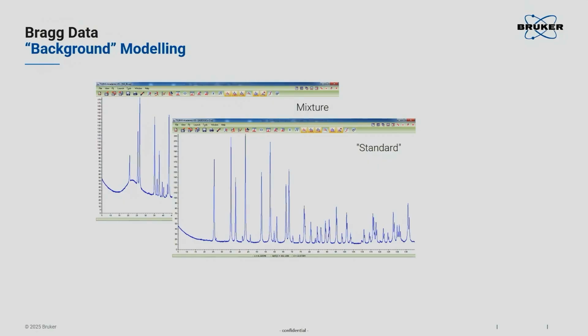Try different things without sample holder, and make sure that the data for the background are consistent. Otherwise, you may introduce more problems. But yes, it would be ideal to measure it without even the sample holder. Not possible though.